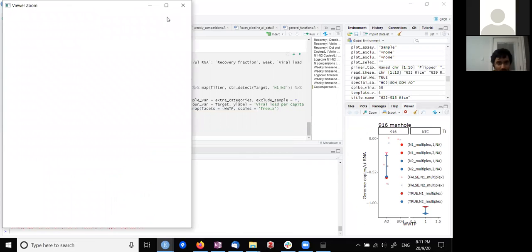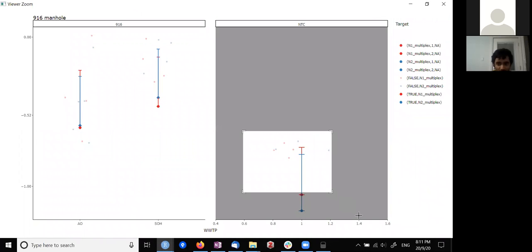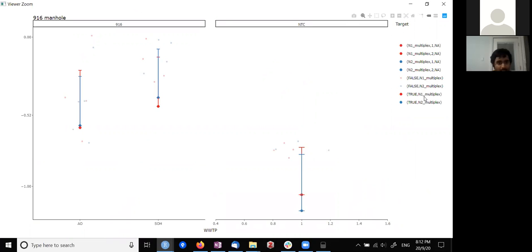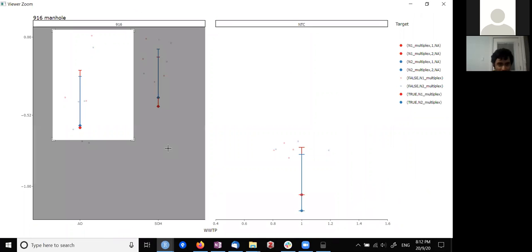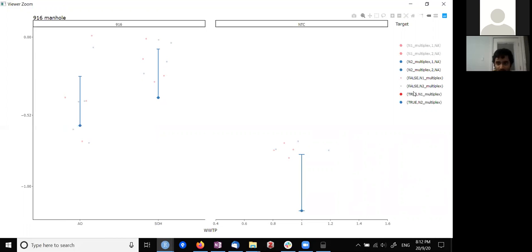And the cool thing about this is an interactive plot. So you can uncheck a few points that you don't want or something like that. You can zoom in. Yeah, so there are a bunch of stuff that you can do. If you want to analyze a certain data more closely, you can do things like that. Or if you want to analyze only the blue points, you will turn off all the red points. Something like that. So you can do this when you have a high dimension.